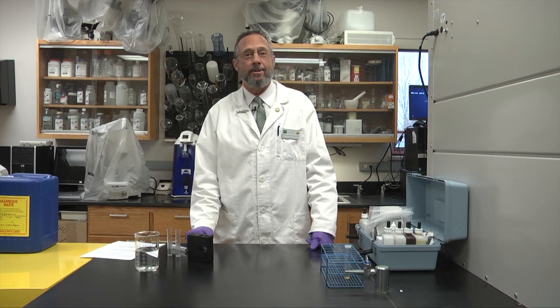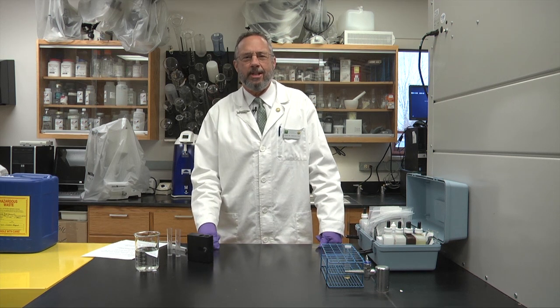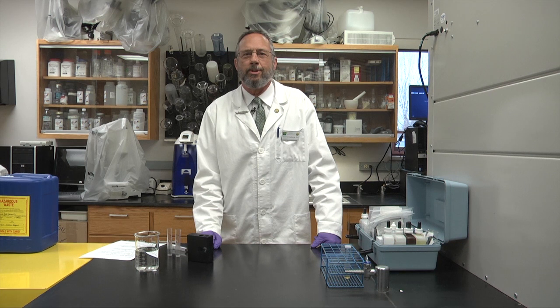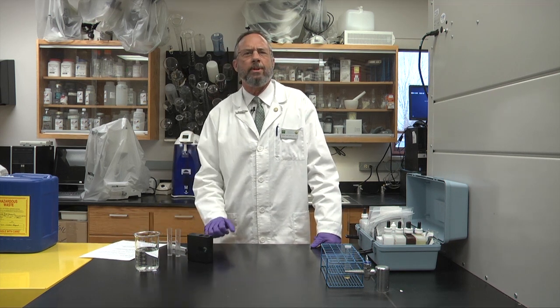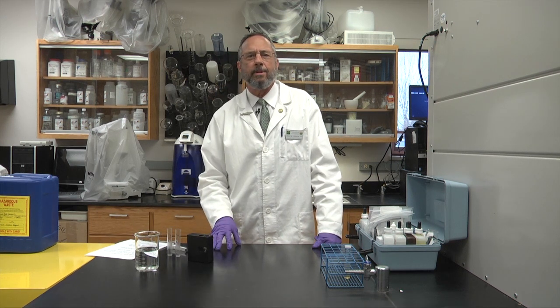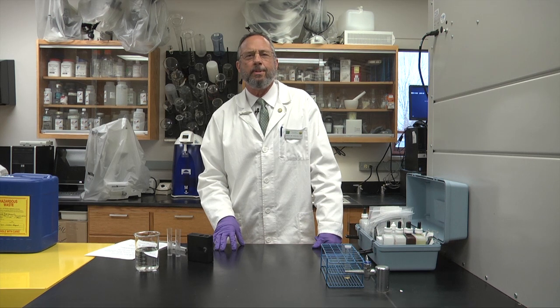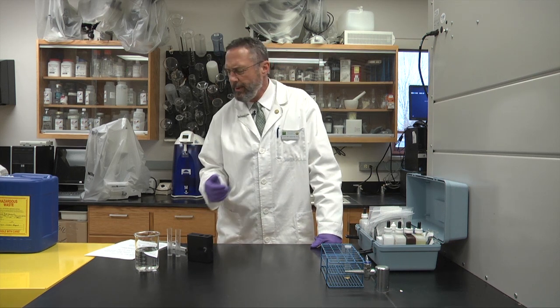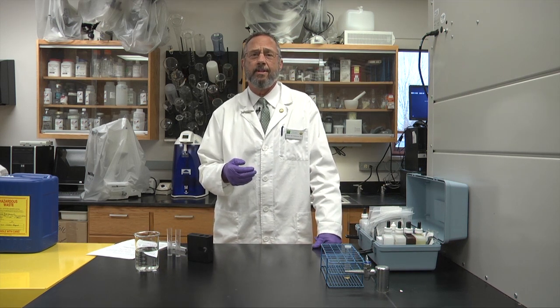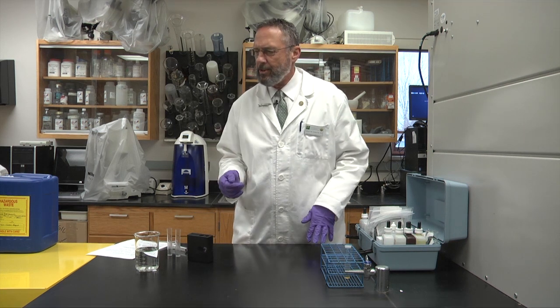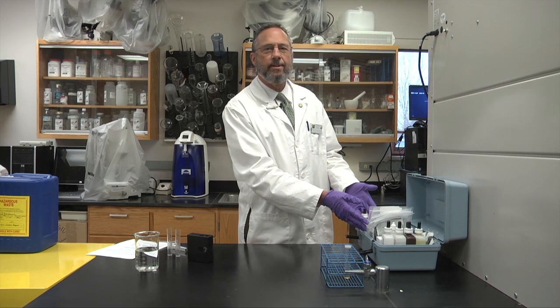Hello, I'm Dr. Bob Derberow, Assistant Research Director for Kentucky State University College of Agriculture, Food Science and Sustainable Systems. I'm also a professor and extension specialist in the Division of Aquaculture here at the University as well. In that capacity, I work with county agents working with landowners managing their ponds, as well as working with high schools and high school teachers that work with closed systems. So one thing that we have to do when we work with people with their water management is check water quality. With the tank systems, whenever you feed fish, there's an ammonia buildup. And the ammonia has to be checked and monitored, or it can be toxic to the fish. The ammonia breaks down to nitrite, and that has to also be checked. So we'll be going through the actual testing procedures using this FF1 test kit here for ammonia and for nitrite.